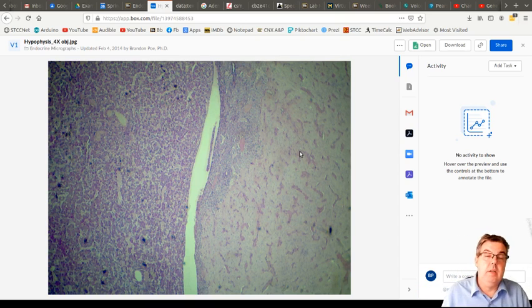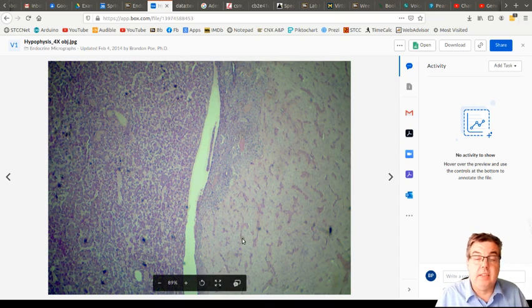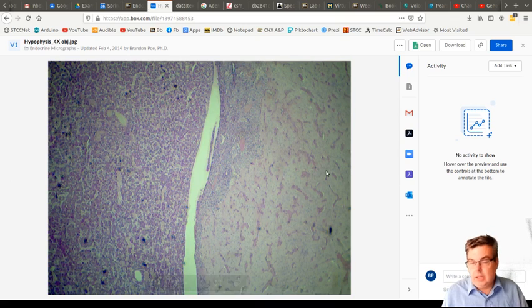They make hormones there, and then they secrete them through their axons into the bloodstream here. Those are called neurosecretory cells. They look just like neurons, but they don't synapse on another cell, but instead they release their contents into the bloodstream directly.